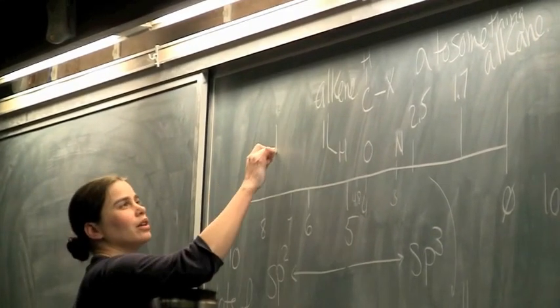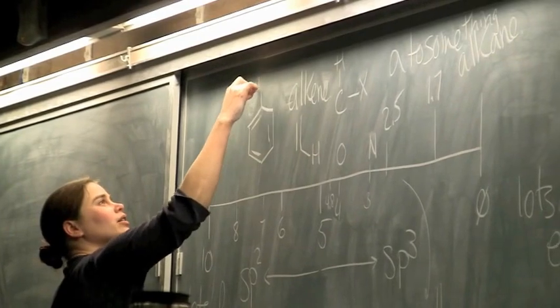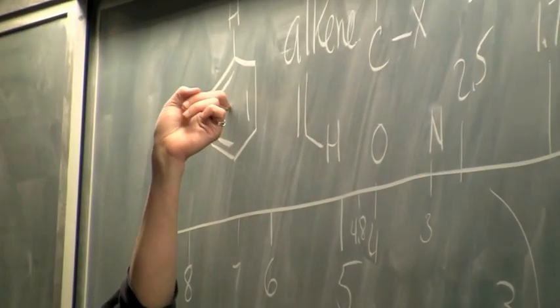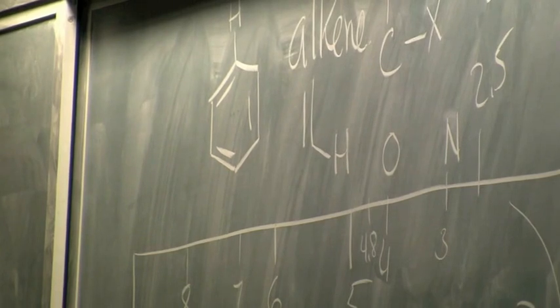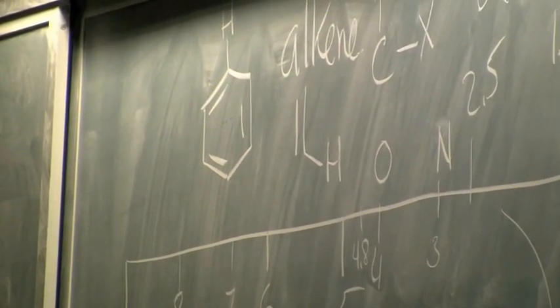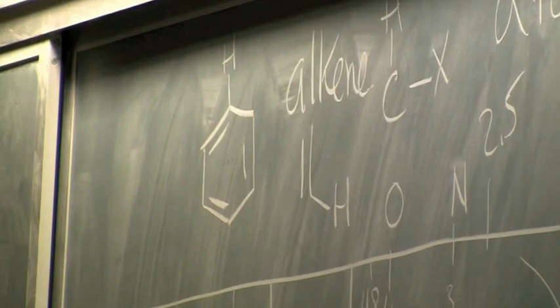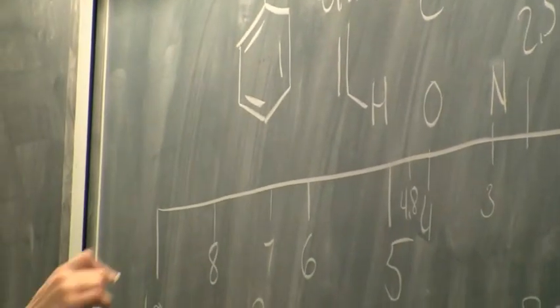We're looking at aromatics. And it's not entirely true why these are exactly the same as those alpha to something interesting, but they are analogous. They're saying, well, we've got a pi bond, and it's next to a pi bond, and it's a little bit more deshielded. There's more fancy stuff going on in there that we'll talk about in 118B, but really, it's a pi bond next to a pi bond. It's a little more deshielded than a plain old boring alkene. So we get that same pattern again.